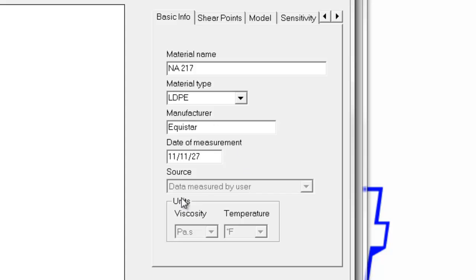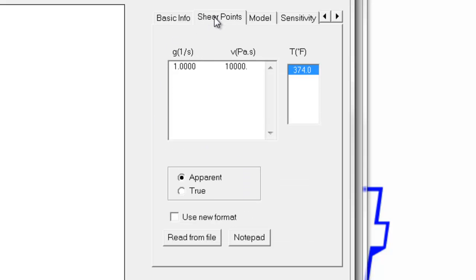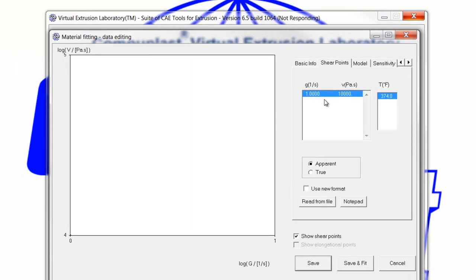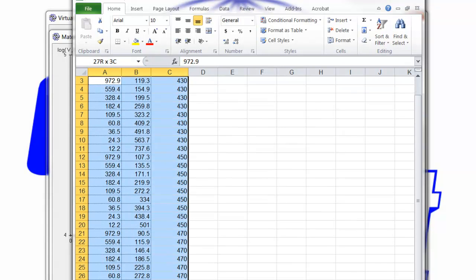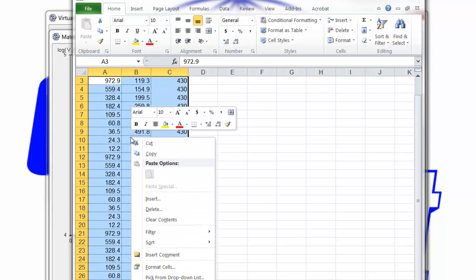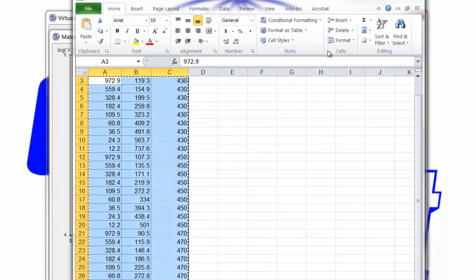Once we've filled in the information in the basic info panel, we move to the shear points. The shear points panel has one default data point when the file was created, shown right here. We want to replace this data point with the data that's in our Excel file. So we go to our Excel file, highlight the three columns, right click, and copy them into the clipboard.